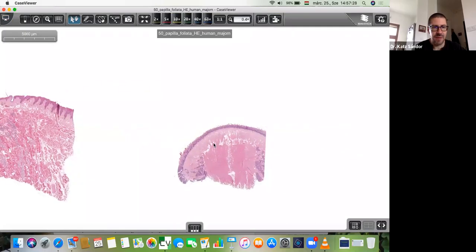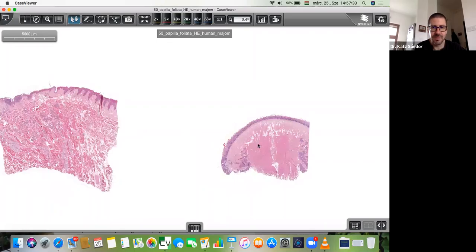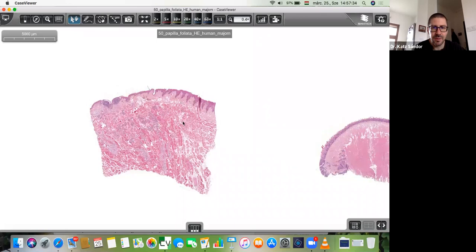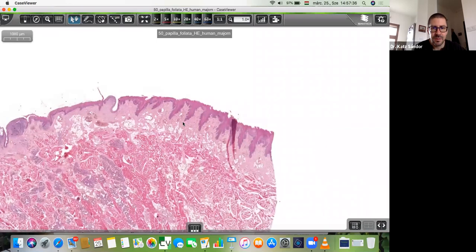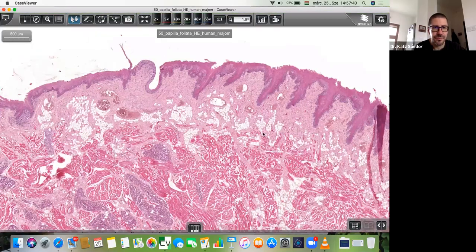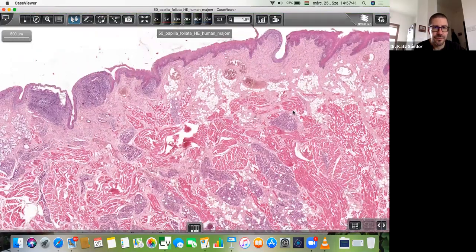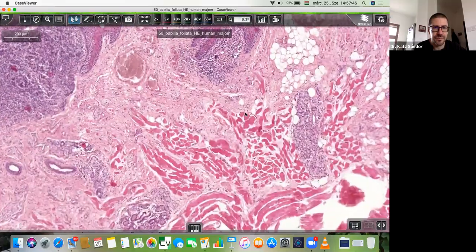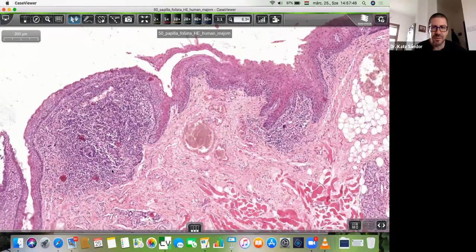Here we have one from the monkey and one from the human. They're not so nice.